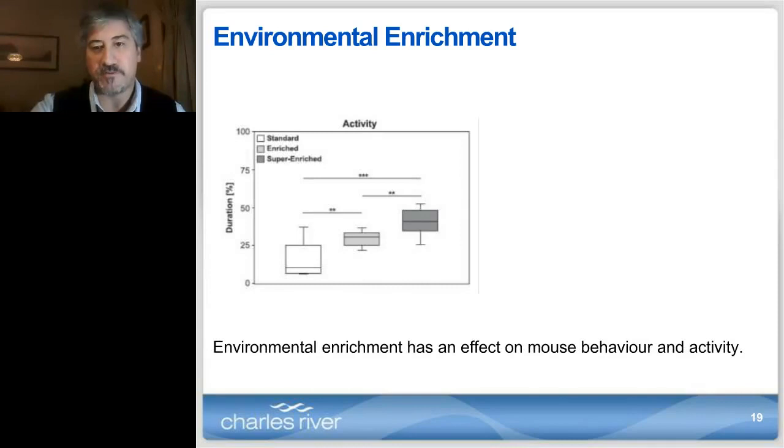So, well, that's the preference of the animals, but the fact is that environmental enrichment may have an impact on experimental results. And again, it is important here the word may have, because if the environmental enrichment had an influence that is always of the same magnitude in the same direction, then we could live with that. But it looks like it's not always the same. For some parameters, it's very important. For some others, it's irrelevant. For some studies, it may have a huge impact. For some others, it's not so relevant.